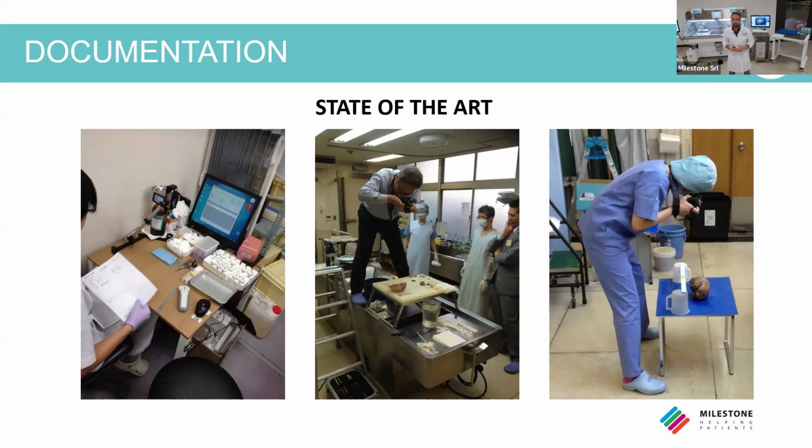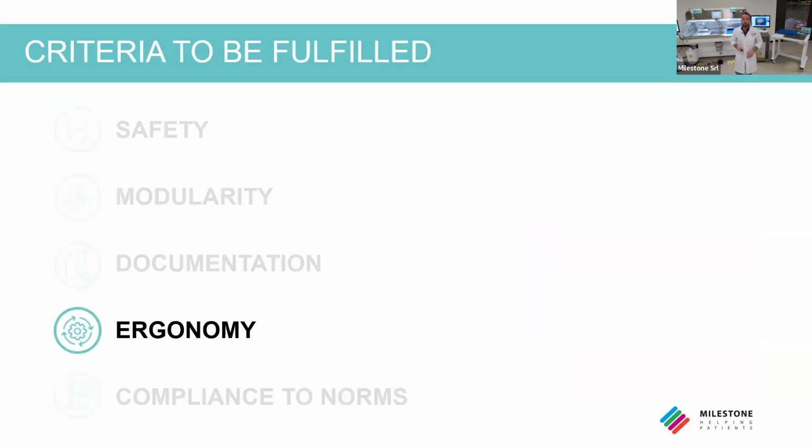Moreover, the last image shows an operator taking a picture in a not so nice position, because that operator, of course, won't feel at ease taking this picture. Again, it's dangerous for the sample and also for him. So from these images, documentation is mandatory, first of all, but ergonomics is also extremely important.